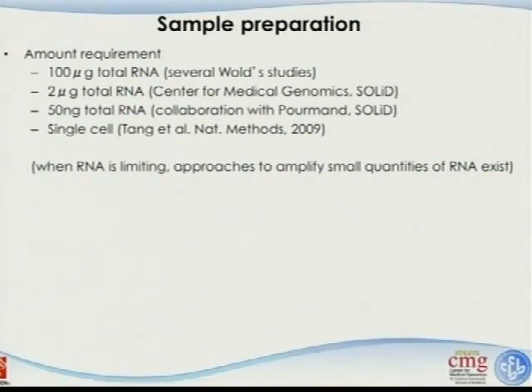Although we don't have a limited amount of blood, we still have a lot, right? But sometimes for the RNA sequencing, you have to go back to the original tissue. It can be really, really difficult, right? You study alcohol, you don't get people's brain. And if you get it, you really don't want to use that very aggressively. You want to save it, right? So our concern is how much initial material we need to use.